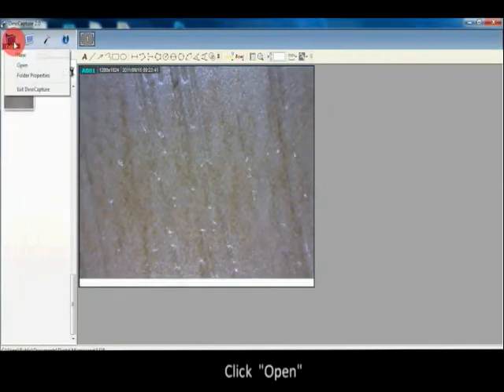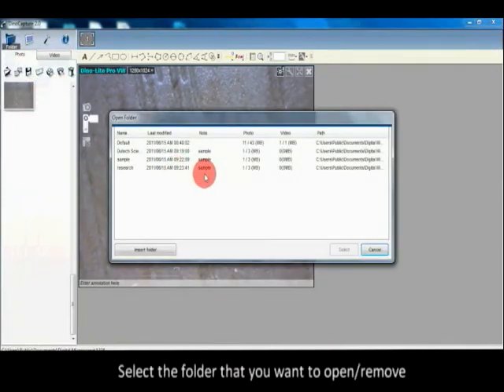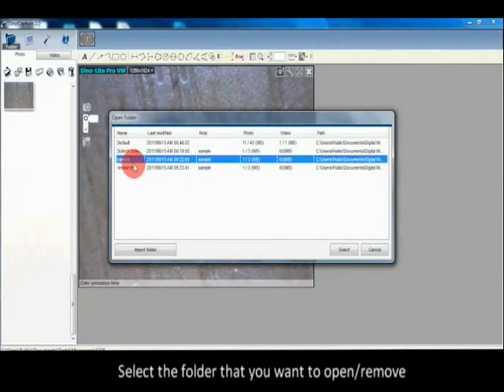Click open. Select the folder that you want to open or remove.